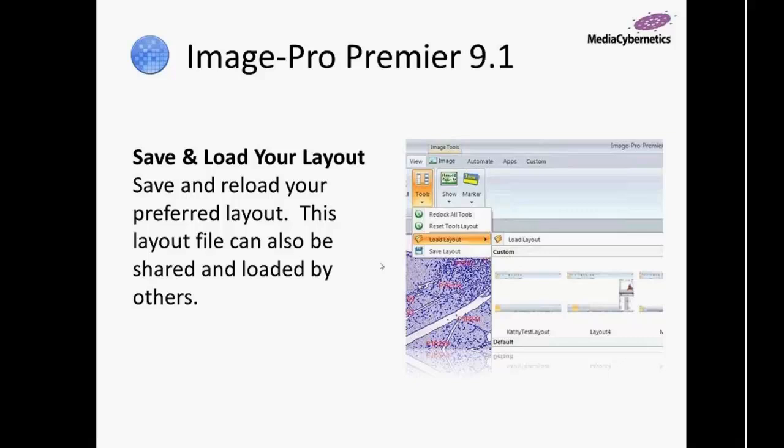If you'd like to have many users that are all logging in separately, have the exact same layouts, have calibrations, have lenses that are all set up identically, what you want to do is use all of our tools available to save your layouts, save your configuration files, and all of your lens and calibration settings, put them into a centralized location, and allow other users to access those and just simply load them in as you see here. It's really straightforward and easy to make sure multiple users are able to access all the same information.